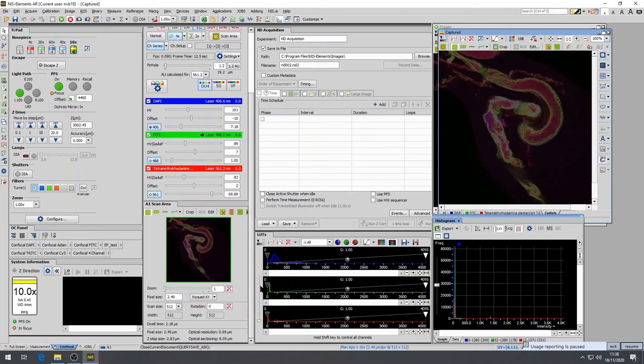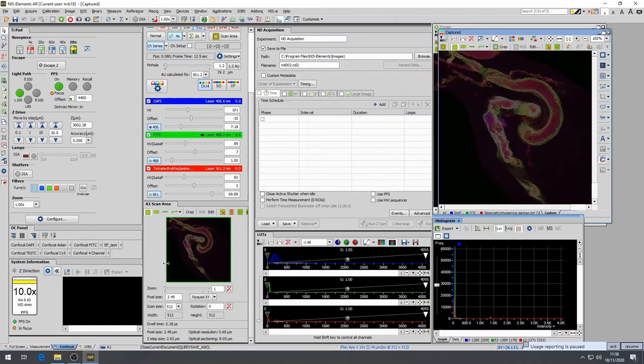The first is to select the Nyquist XY in the A1 plus scan area. Pressing this button will tell the computer to calculate the optimal sampling step size in XY for the given objective. The Nyquist sampling rate allows for the optimal spatial resolution in XY for your sample to be achieved. As such, your sample will be properly sampled.